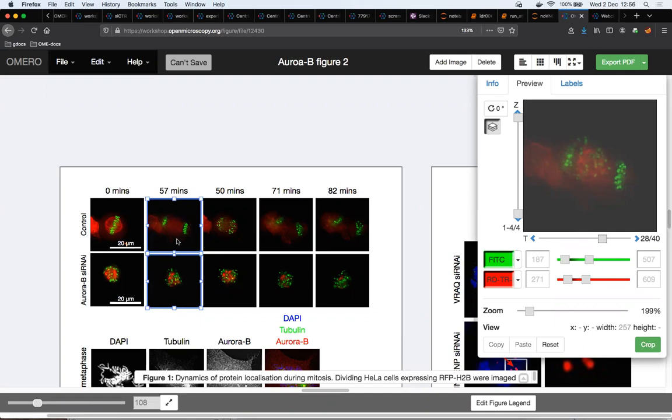And because all the labels are, so to say, live, they are connected via OMERO figure to OMERO, and OMERO knows what the delta t between the time point planes is, as well as how many time point planes I passed through when scrolling, etc. OMERO figure can ask OMERO on the fly and change the values as appropriate, both the image displayed in the viewports as well as the label value which corresponds. Okay, I hope that you understand now the power of OMERO figure.